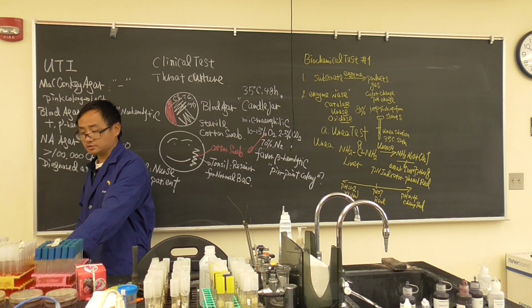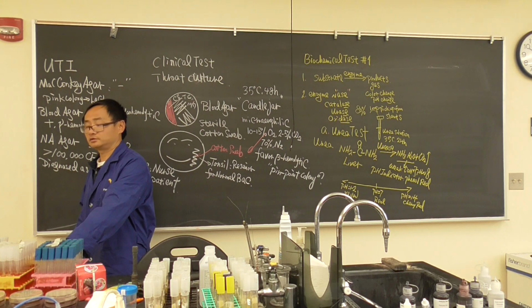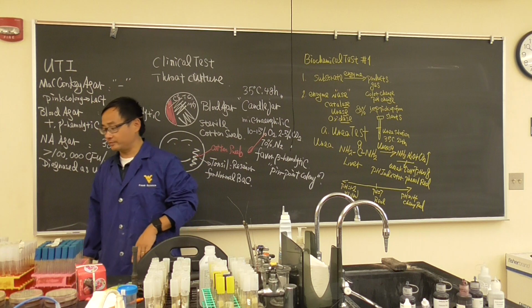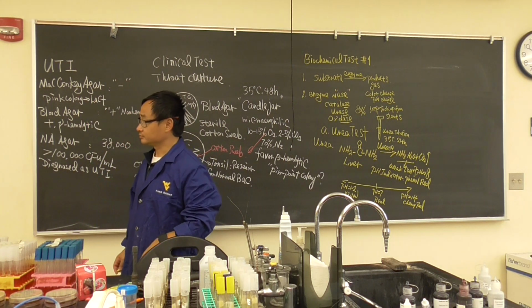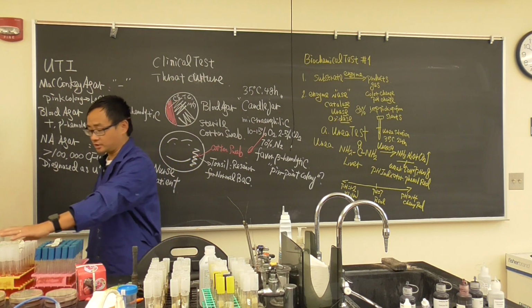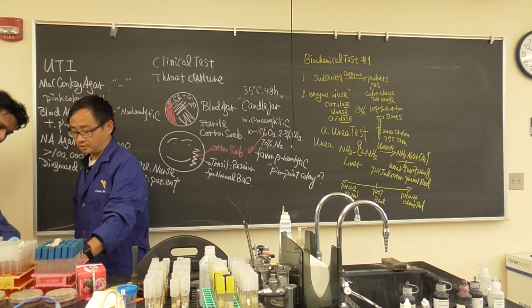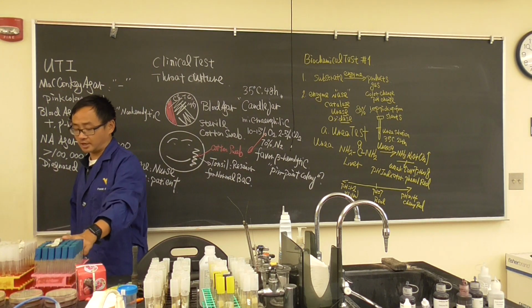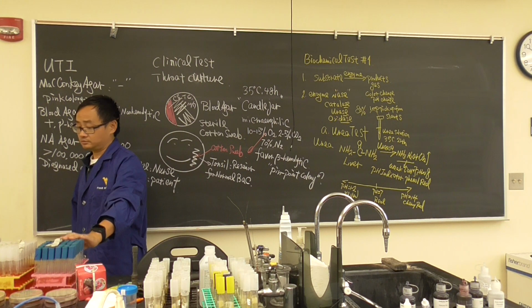One of them is glucose, sucrose, and lactose. Which one is which? That you have to remind me. Glucose is this one. Which one is glucose? This one. That's glucose. Yeah. This one is the dextrose glucose and this one is just normal glucose. Okay, the dextrose glucose. How about that one? This is the mannitol. That's mannitol? Yeah. Okay.